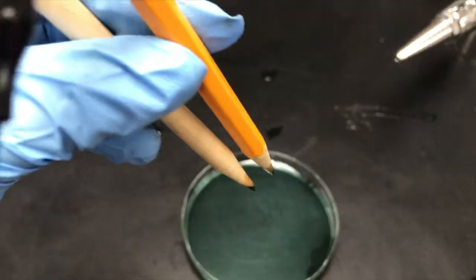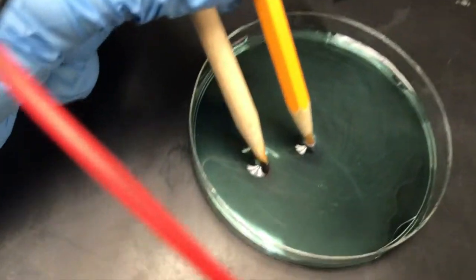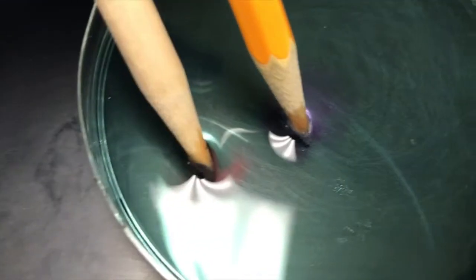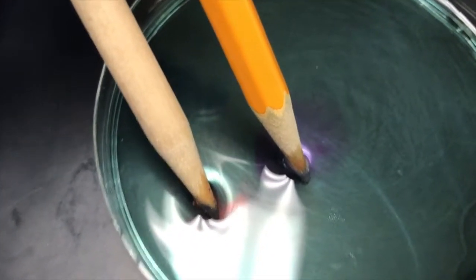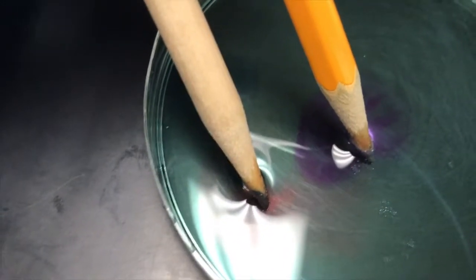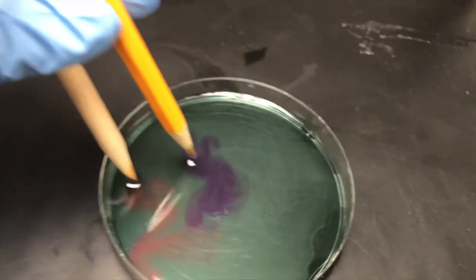So now if I take the two electrodes, make sure they're not touching, and allow them to touch the solution, what you can see happening is, look at that purple one, you've got bubbles forming on that one, and it's turning purple. For the other one, bubbles are forming as well, but now it's turning pink.